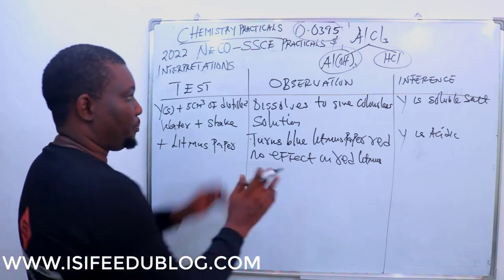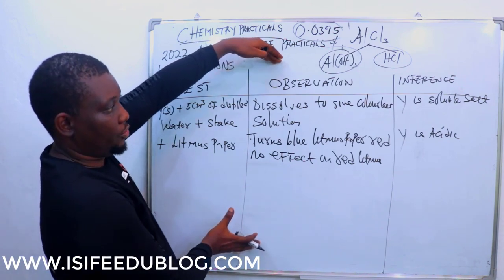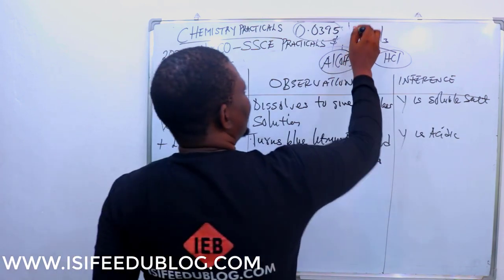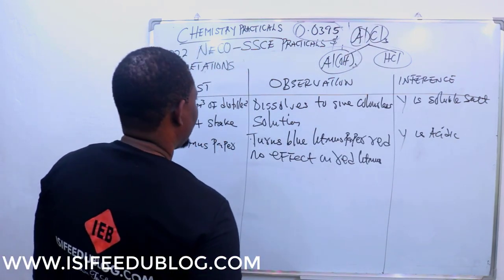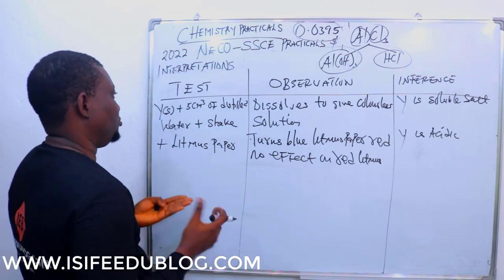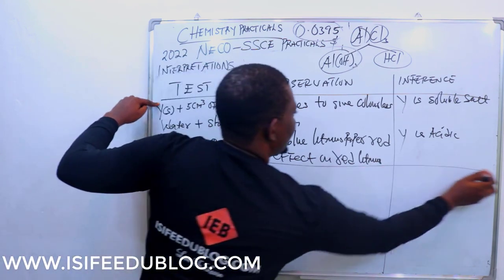So, like we did previously, these are going to come in the same table. Okay, after X, this is Y. You're just testing for this and this. Okay, but I'm going to start with Cl. So we're going to split the solution into 2 or 3. That means whatever I have here now will be a solution.